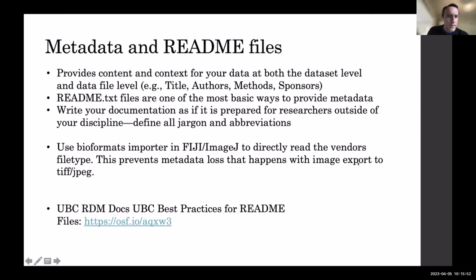So one thing to note is that you should write this kind of documentation as if it's going to be used by someone who's outside your discipline and potentially doesn't know the jargon and doesn't know the abbreviations, just to try to make it more clear.